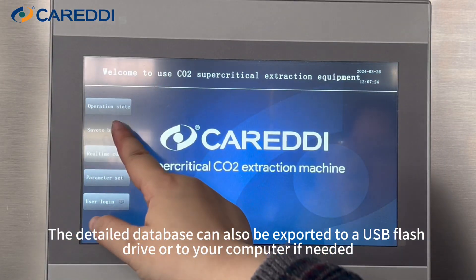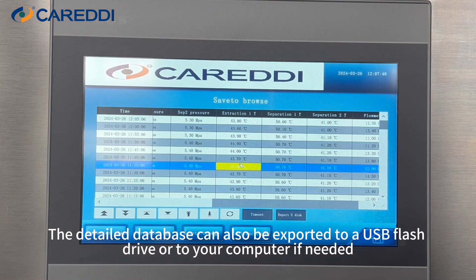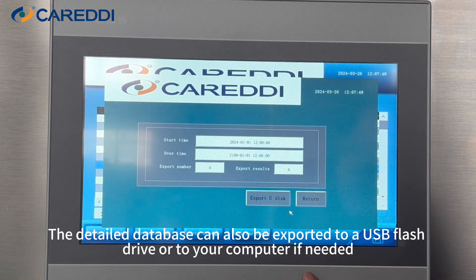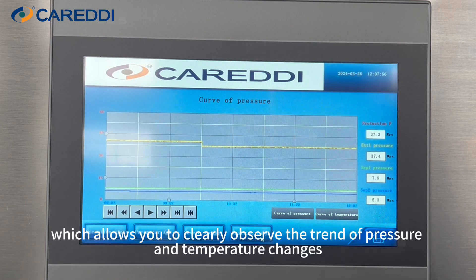The detailed database can also be exported to a USB flash drive to your computer if needed. The system is also equipped with a real-time curve function, which allows you to clearly observe the trend of pressure and temperature changes.